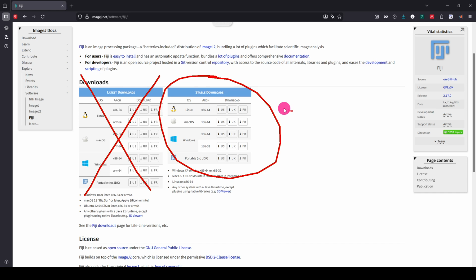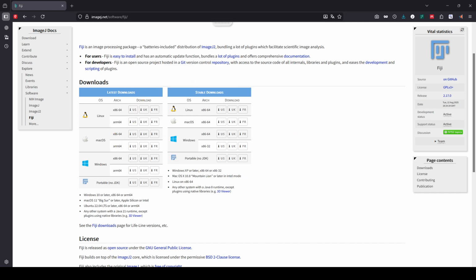If you have Fiji already on your computer, you can install as many Fiji versions as you want to. So you can just download the newest version and install it in a different folder or so. These different versions do not interfere, so you do not need to delete your old installation if you want to use this still for something.